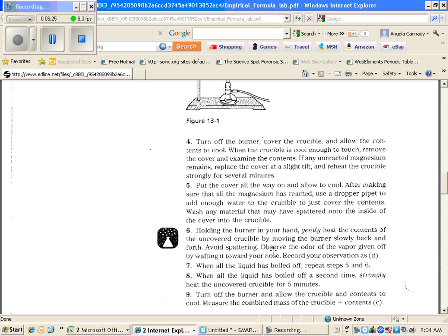Don't stick your nose up there next to it and get a great big breath. Wave it toward you and see if you smell something. Then record what you think it smells like. If you can't tell whether it's strong odor or light odor, just record what you see.